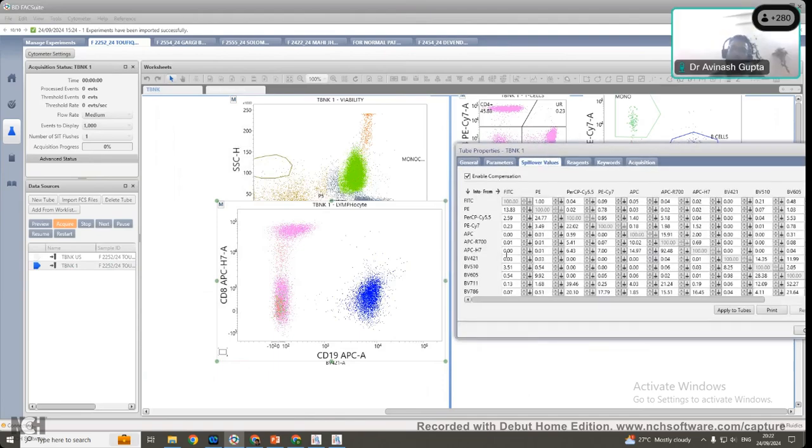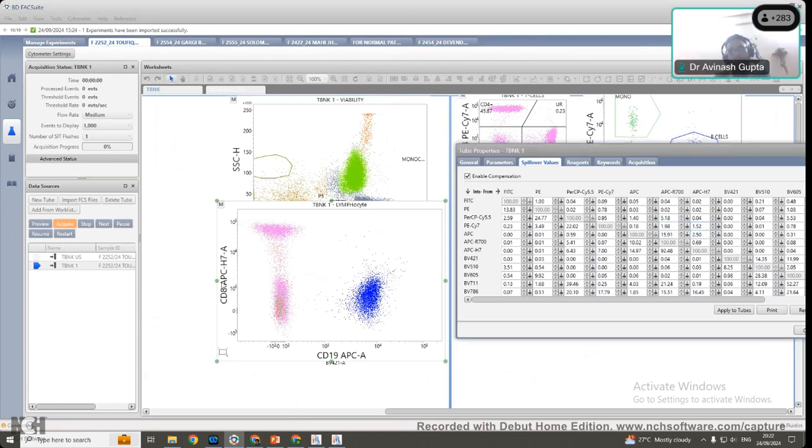Yes, sir. So I just want to tell them that whenever you are going to report, you go through your assay and see where it is coming from, because we know that CD19 is an exclusively B cell marker. Why would CD3 positive T cells show you CD19? So we have to go back and check whether there is any compensation error, whether there is any spreading error, or otherwise somebody will say that these T cells are having dim CD19 or a subset of T cells is having CD19. It is not like that. Now you can see it is properly a spreading error. Y shape. Yeah.